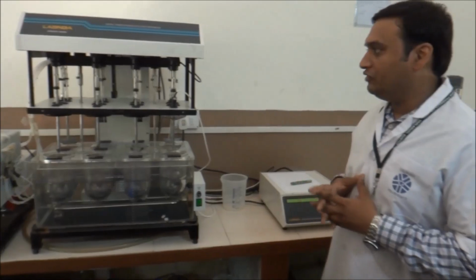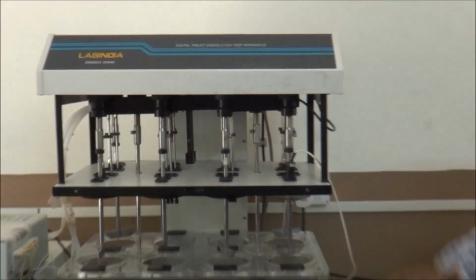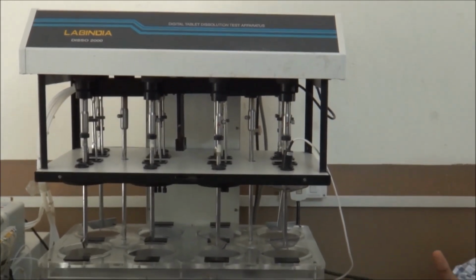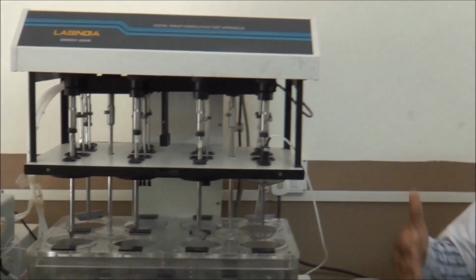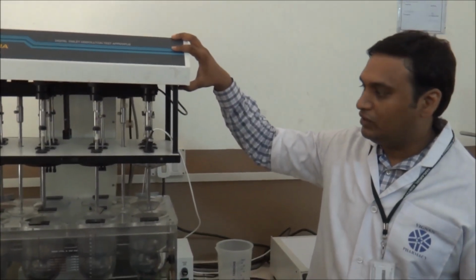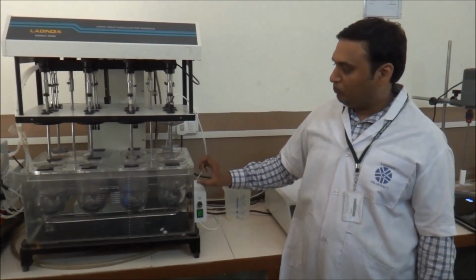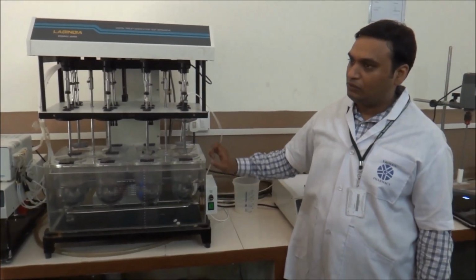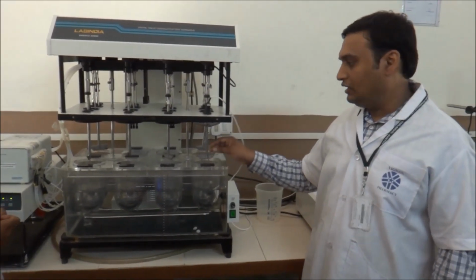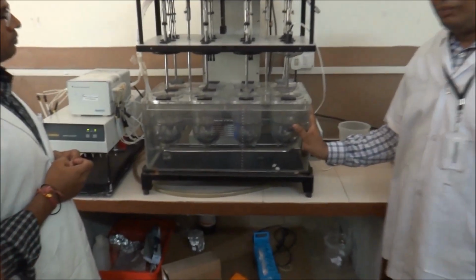Coming to the visible components, the upper part which you are seeing is a movable hood, which is moved by a hydraulic pump used for lifting the hood up and down. This movement is very important in maintaining sufficient height of the paddle or basket from the bottom of the tablet. We will be discussing the importance of this height later. So this is called the hood, and this is called the bathtub.